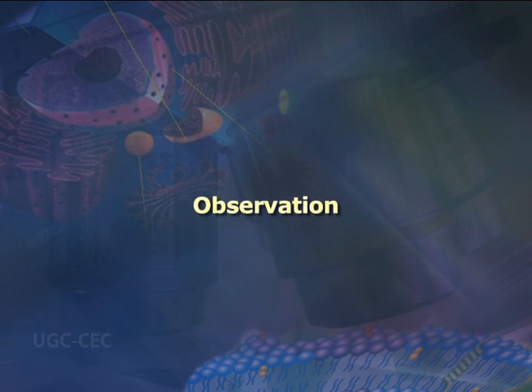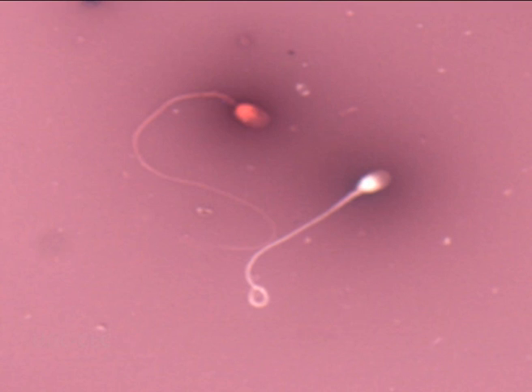Dry the slide rapidly by placing it on a warming plate or waving it back and forth in the air. Examine using a bright field microscope, typically using a 40 to 100x objective lens. Observation: the nigrosin eosin stain produces a dark background on which the sperm stands out as lightly colored objects. Normal live sperm exclude the eosin stain and appear white in color, whereas dead sperm, that is those with loss of membrane integrity, take up eosin and appear pinkish in color.